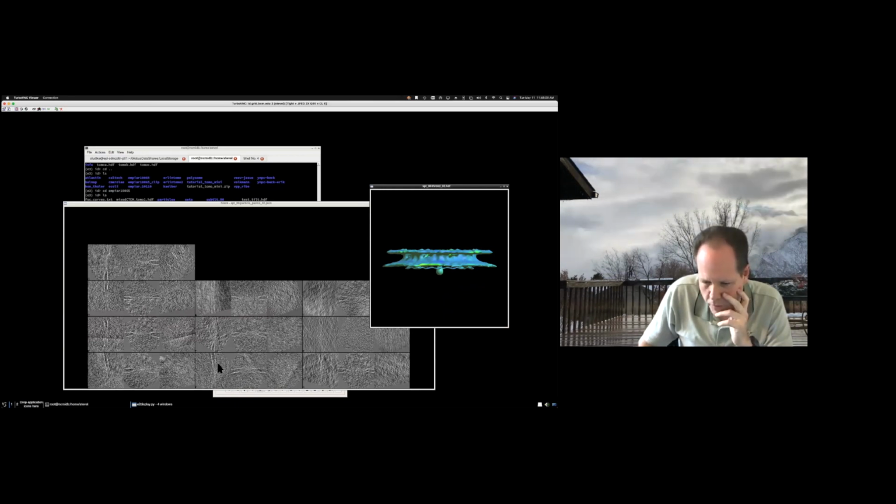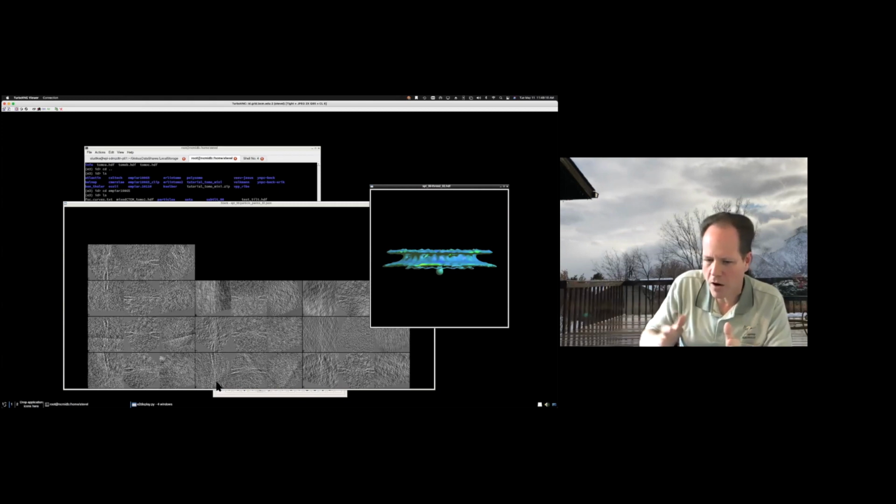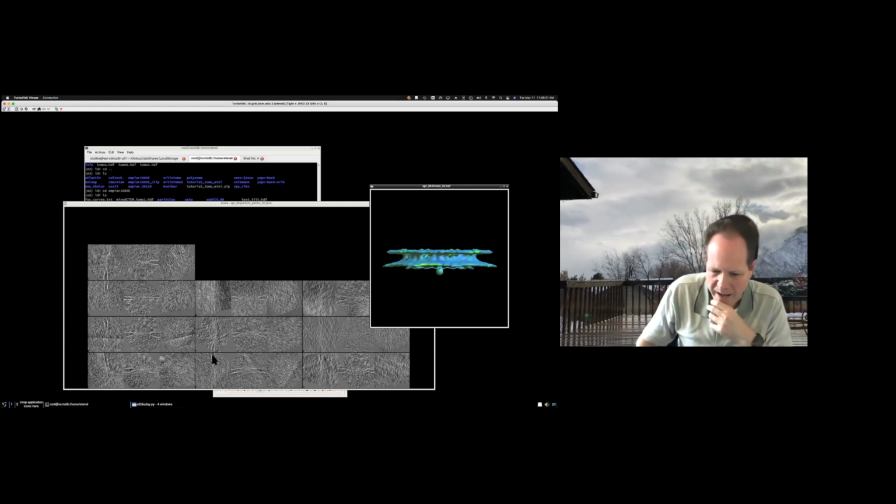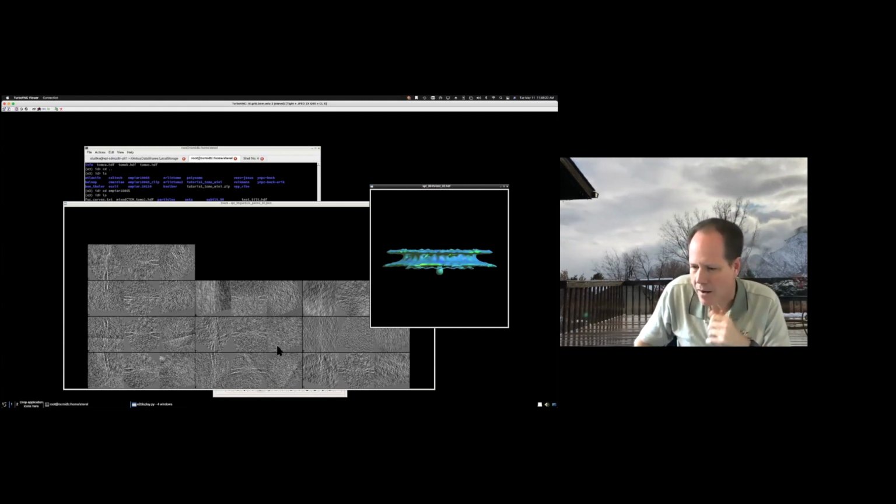In this orthogonal view, you can see the double membranes coming in this side, but you don't see anything here. This is actually a case where the tomogram was cut off by the FIB milling process, so the top of the pore was actually FIB milled away. So we only had one side of the channel. Anyway, this gives you a quick tool for looking at individual particles when you're doing subtomogram averaging.